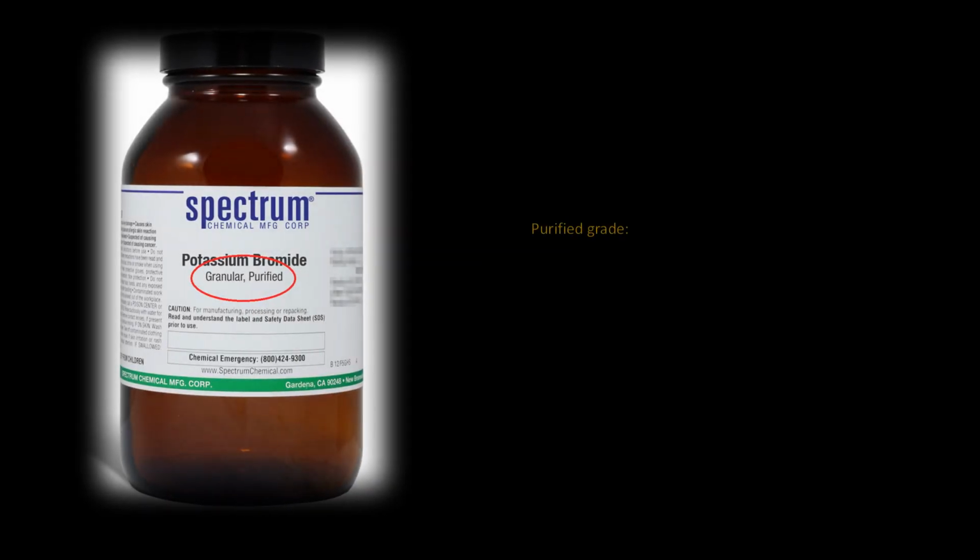The purified grade simply means that the chemical is physically clean and of good quality. However, it does not meet the ACS, reagent, USP, or CP grade standards of chemicals.